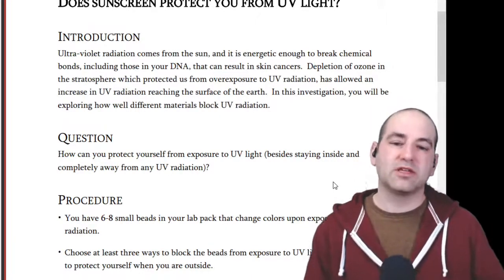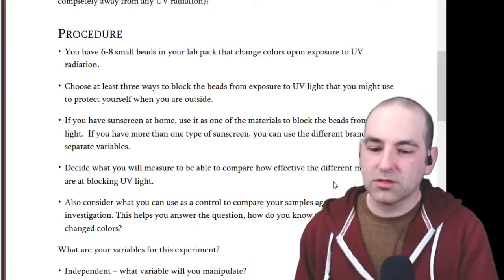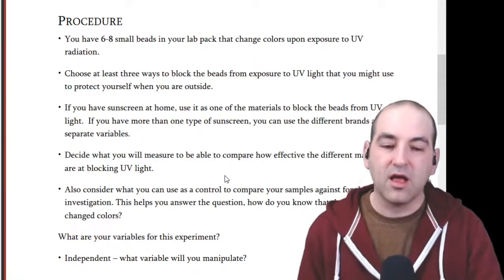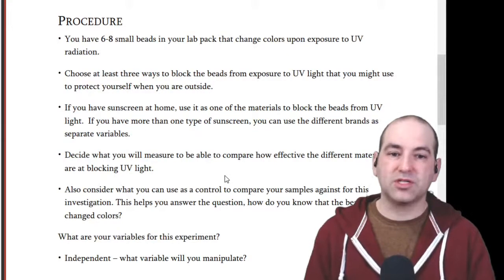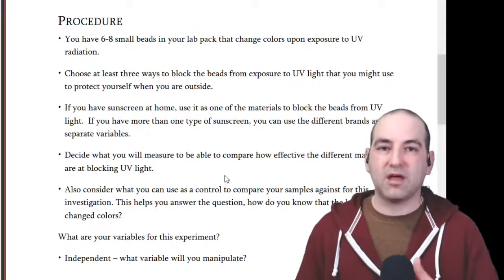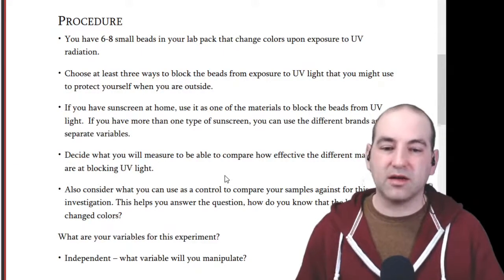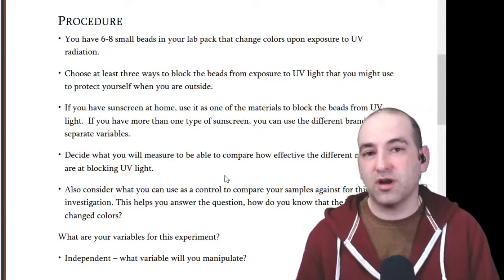So you want to test how these things behave, and you want to set up an experiment that works. So like this fourth bullet here, what are you going to measure to be able to compare how effective the different materials are at blocking UV light? So some ideas, you could, for instance, pick a time and just say, all right, after 20 minutes, I'm going to see if any of them have changed color. But that might be too short or too long. That's just a time that I picked. And it's going to depend. Maybe that's too long and everything's changed, so you can't really tell any difference. Maybe it's too short and nothing's changed.